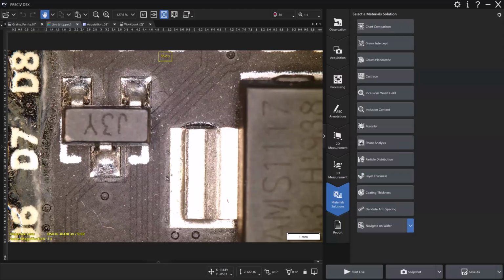What's great about the custom solutions, we can have them built from scratch specifically for a customer's need and workflow, or we can take one of the ones that they've already done and modify it to tweak to the needs. If it's just small adjustments, things like maybe they want a different way they're doing the image format, or maybe they want a different output rendering of the data into a different text document type. So that can be done through our custom software development group.